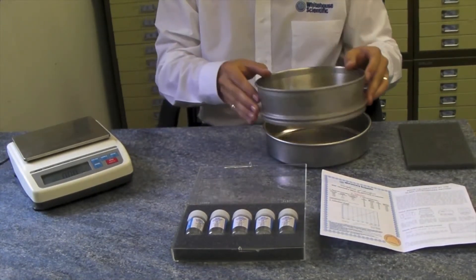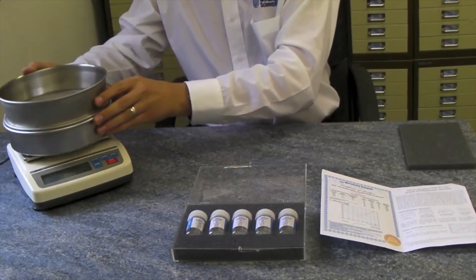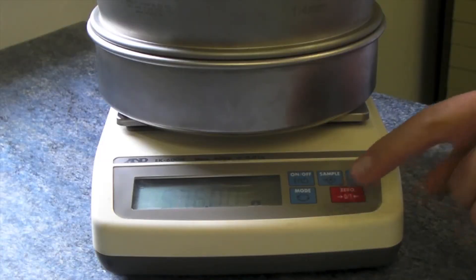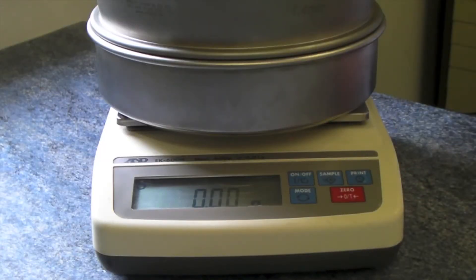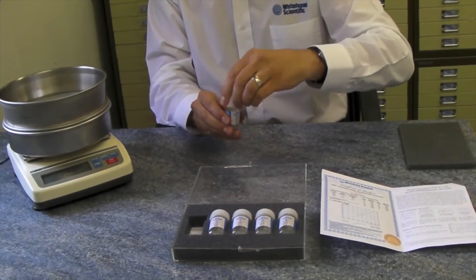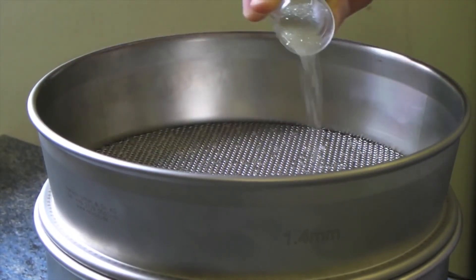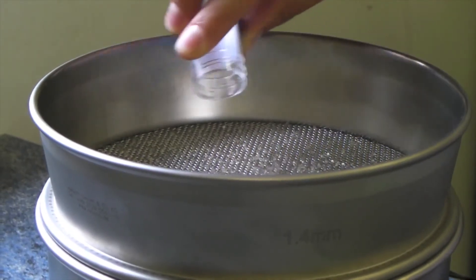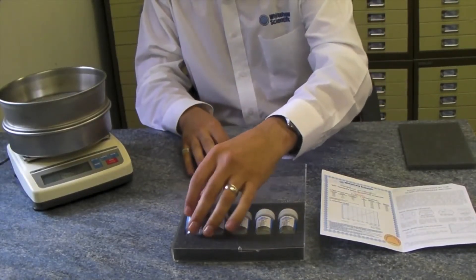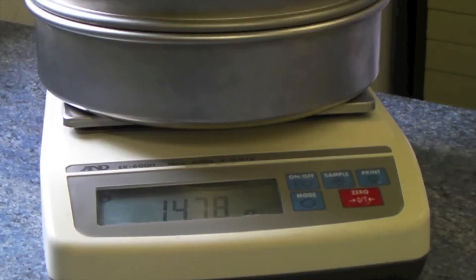To calibrate your sieve, firstly place it onto a sieve pan and onto a balance with a minimum of two decimal places. Ensure the balance is tared at this point. Take one single-shot bottle and empty the entire contents onto the sieve surface. Record the initial weight of the standard.